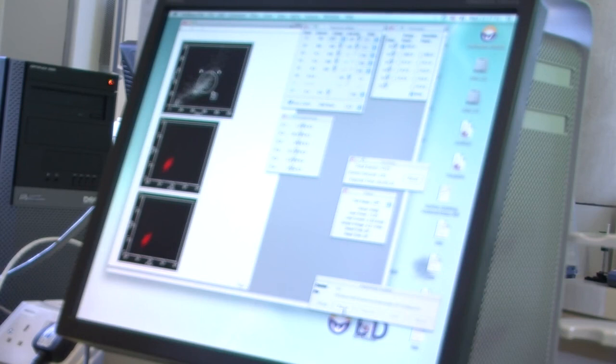You often start with 1 million cells. But what you could be looking at is 100,000 events, and then you might be looking at subpopulations within there. So you might need to acquire 200,000, 300,000. So you start with 1 million to ensure you've got more than enough. But yeah, 1 million is reasonably standard. So you started with a fairly small pellet, and you've not lost that many. Well done. Give yourselves a clap, because it's the first time you do that. And we're up to 9,800 on the last tube, 10,000. There we go. That's it.